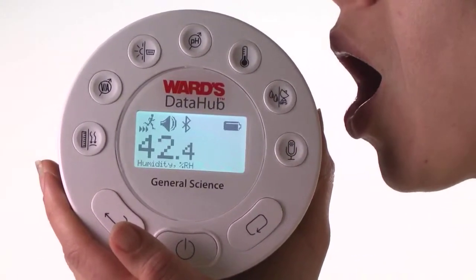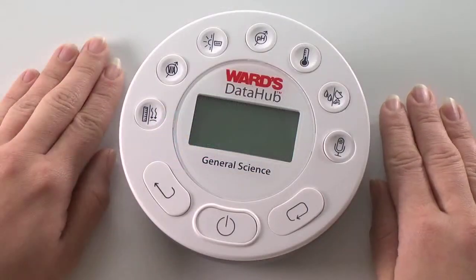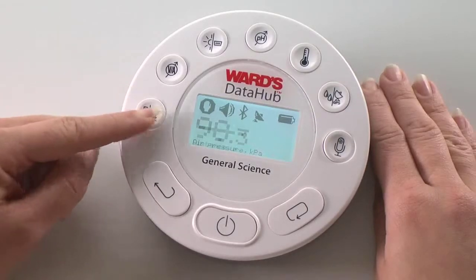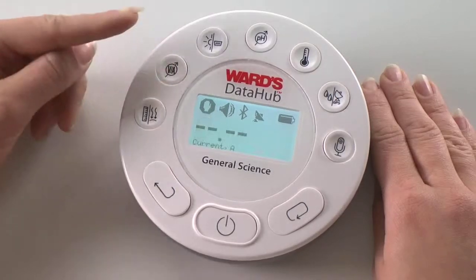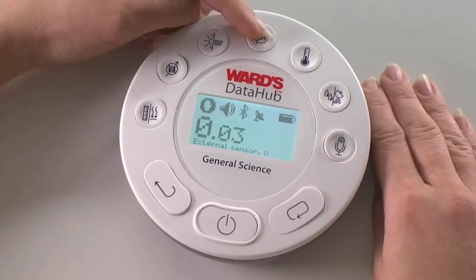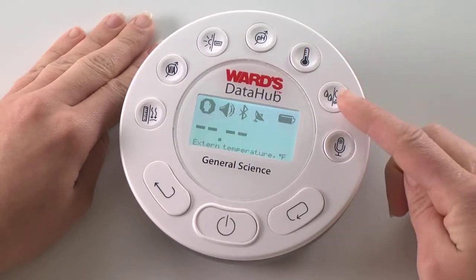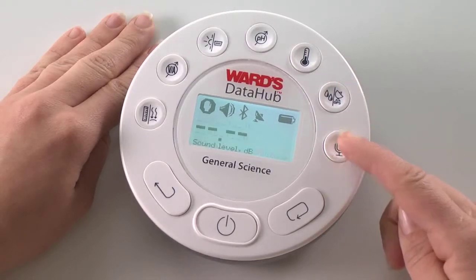The unit features Bluetooth connectivity for wireless integration with your iPad or laptop for live on-screen data analysis. Today we'll use the General Science Data Hub, which features air pressure, distance, voltage, current, light, universal sensor input, pH, ambient temperature, external temperature, relative humidity, GPS, sound level, and microphone sensors.